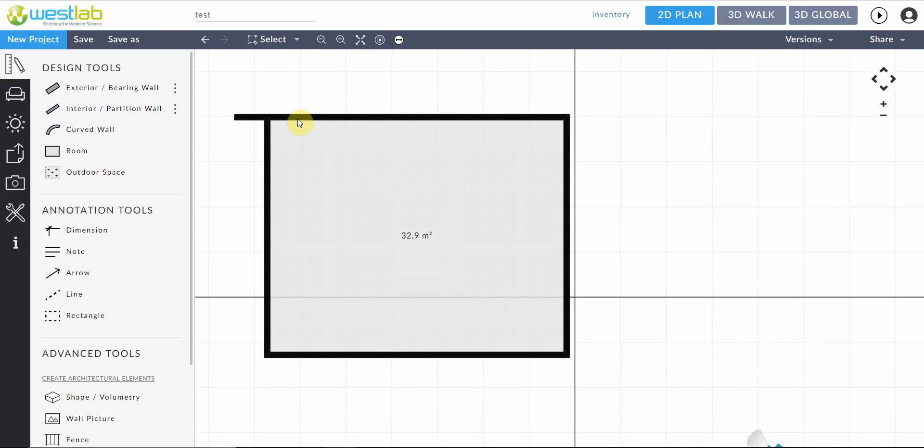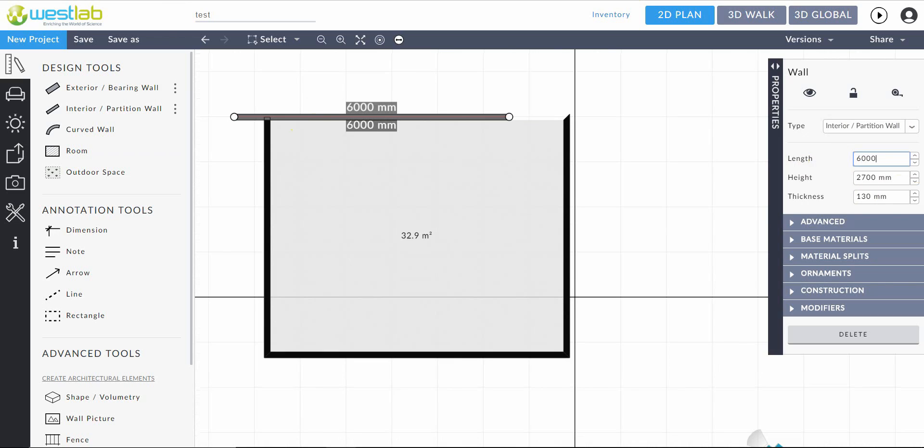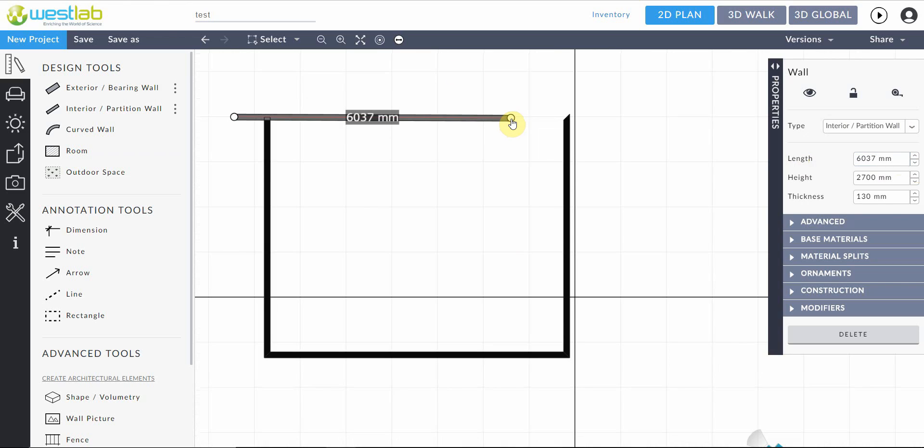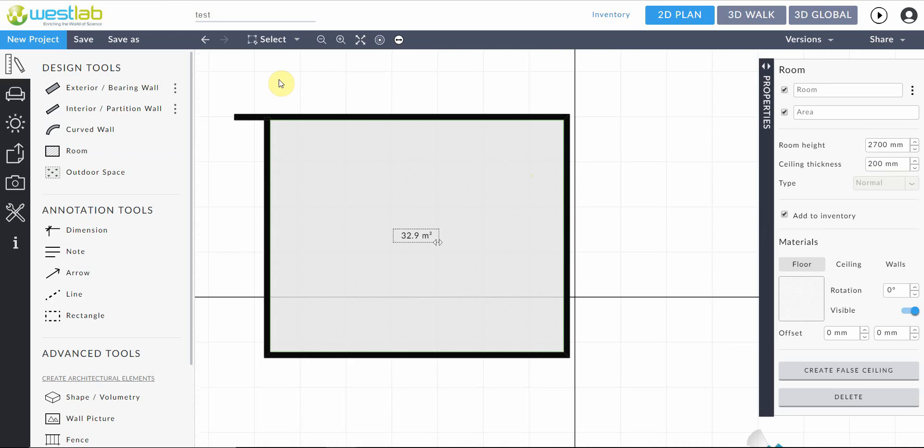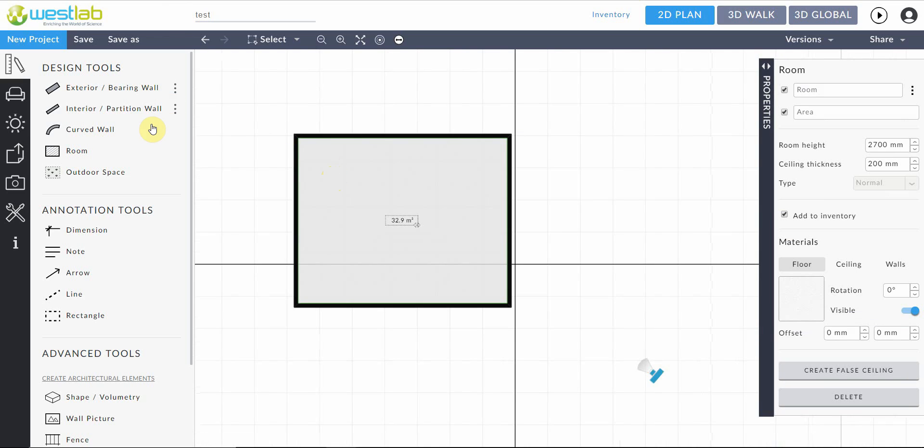You can also change properties. So if you select a wall it brings up the properties. You can also drag them out like so. The interior, exterior and curved walls all have that same function.